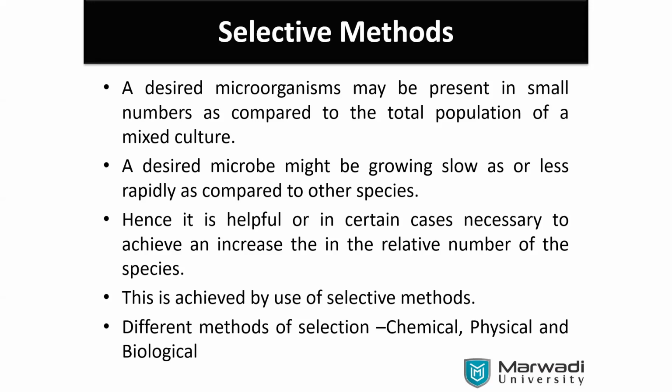Though it is a bacterial suspension, if you are looking for some basic characters, elevations, textures, pigmentations, you will find so many things all together. It is like you have inoculated with a soil sample. Okay, so it is a mixture of it. There are lots of things.